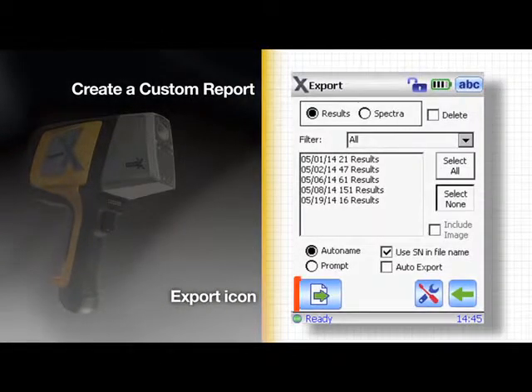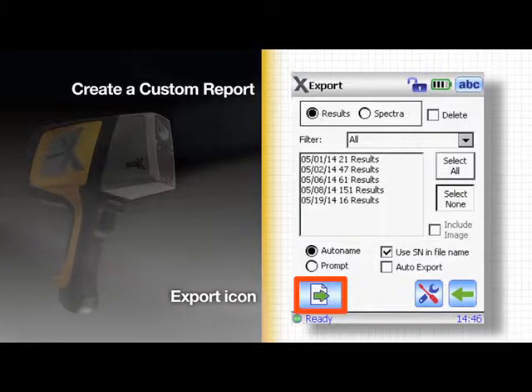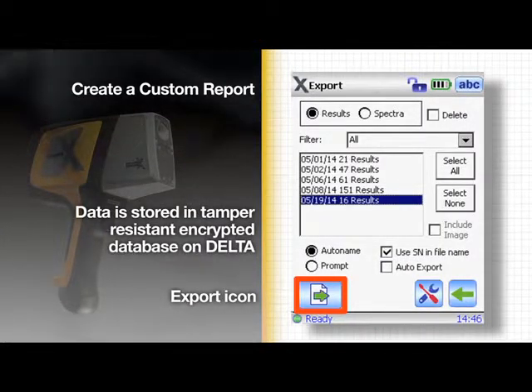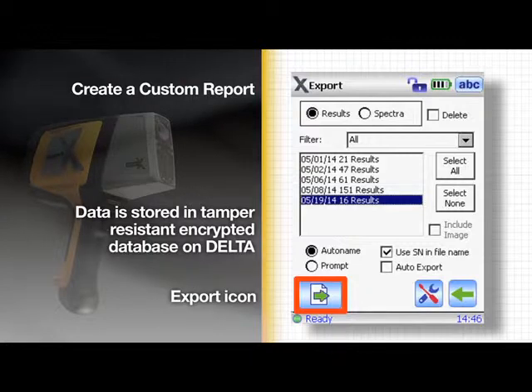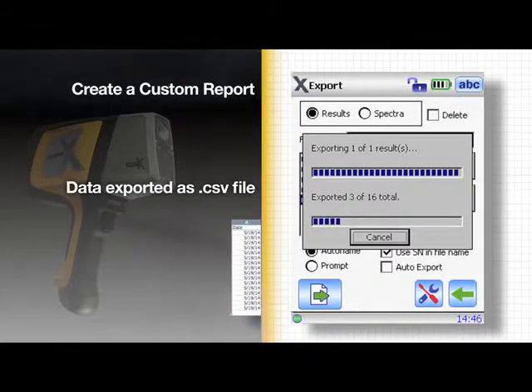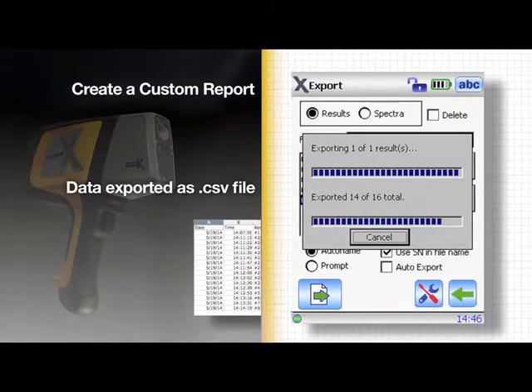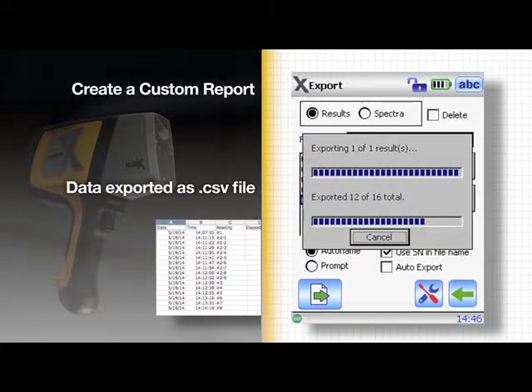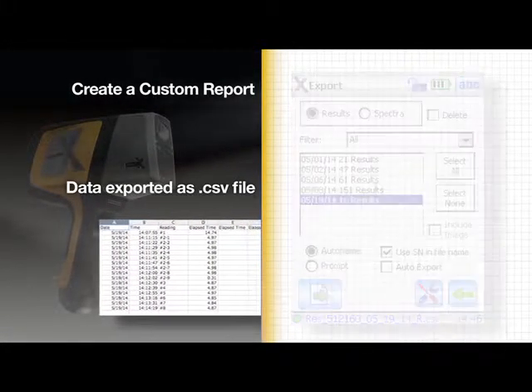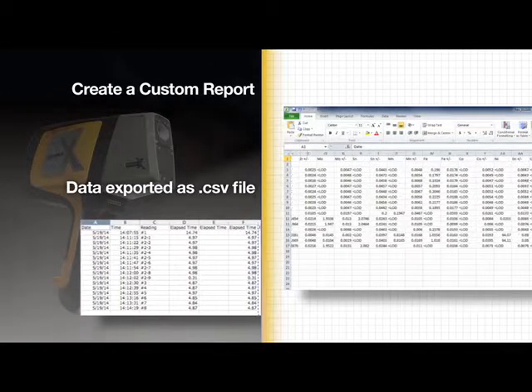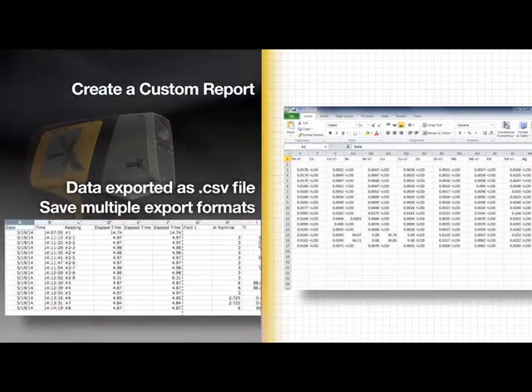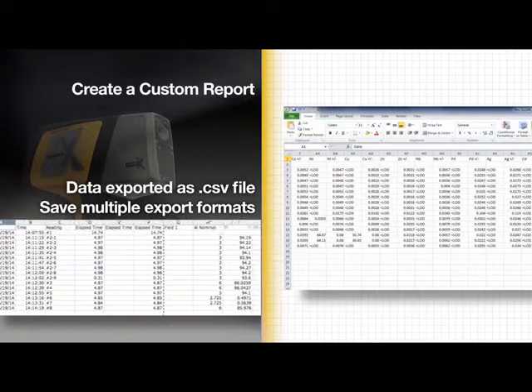Tap the export icon in the lower left hand corner. The test results are stored in a tamper resistant encrypted database on the Delta. The data is exported in a CSV format containing comma separated values, which is easily read by a spreadsheet program like Microsoft Excel. You can save multiple export formats to review test results.